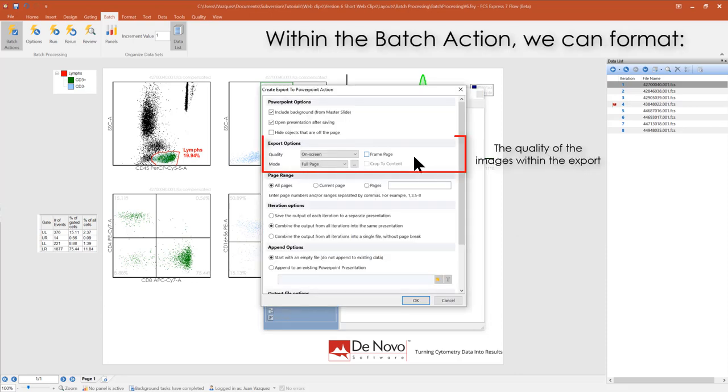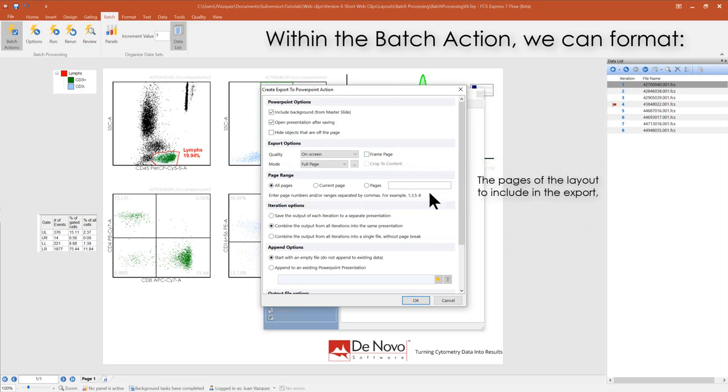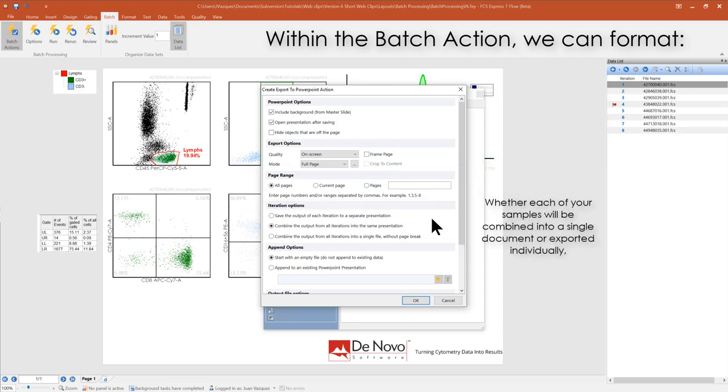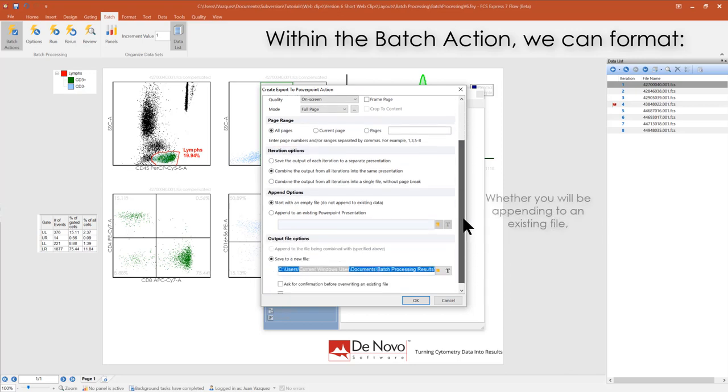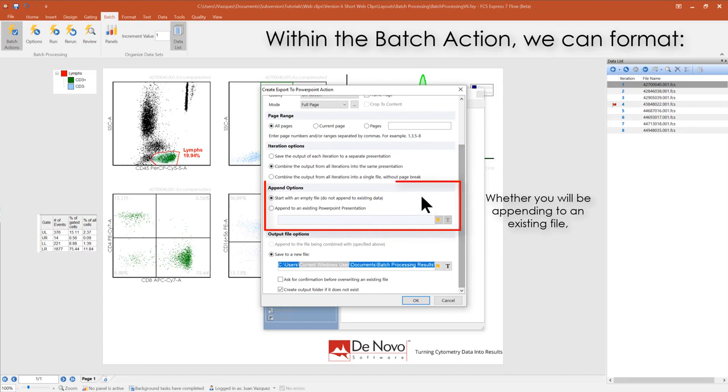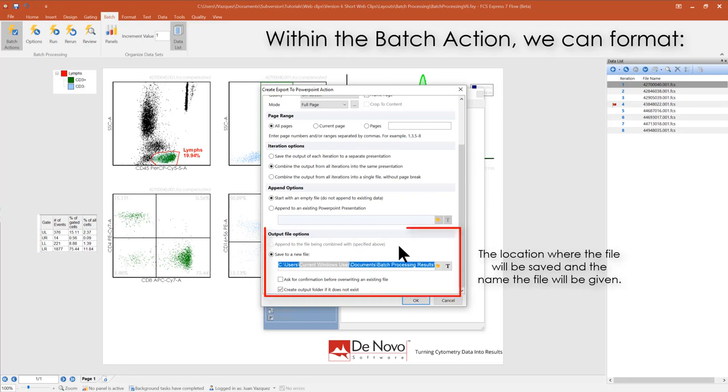Within the Batch Action, we can format the quality of the images within the export, pages of the layout to include in the export, whether each of your samples will be combined into a single document or exported individually, or you will be appending to an existing file, the location to which the file will be saved, and the name it will be given.